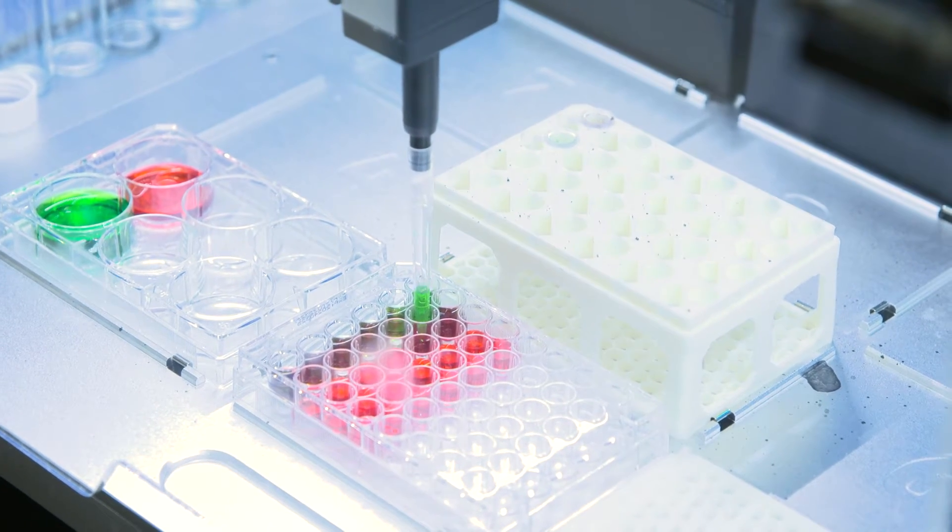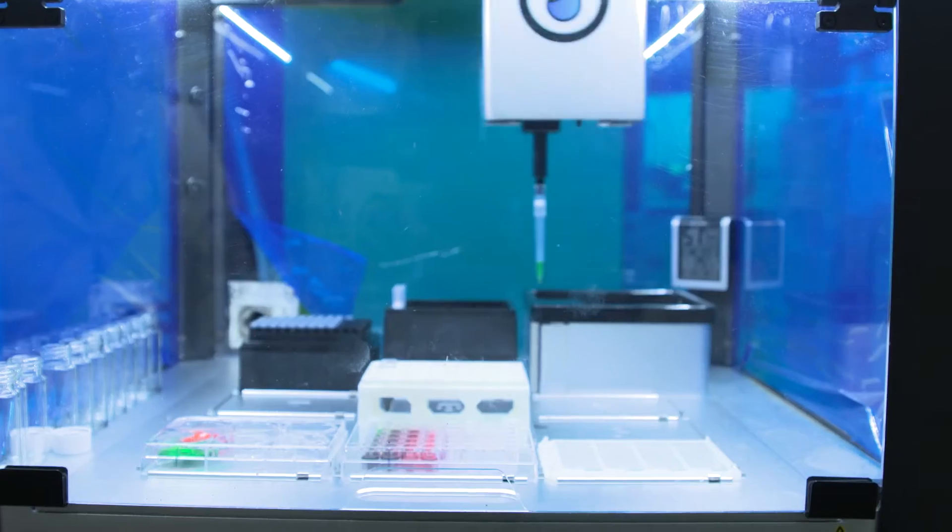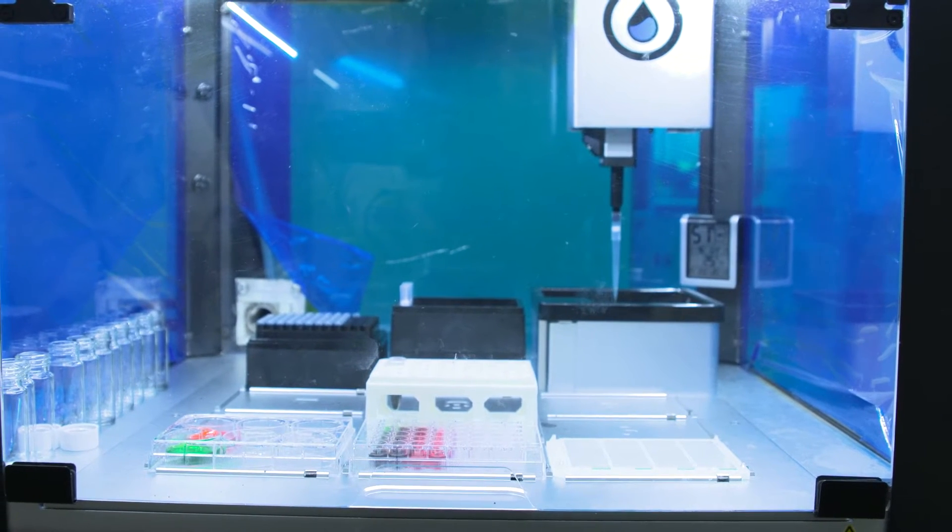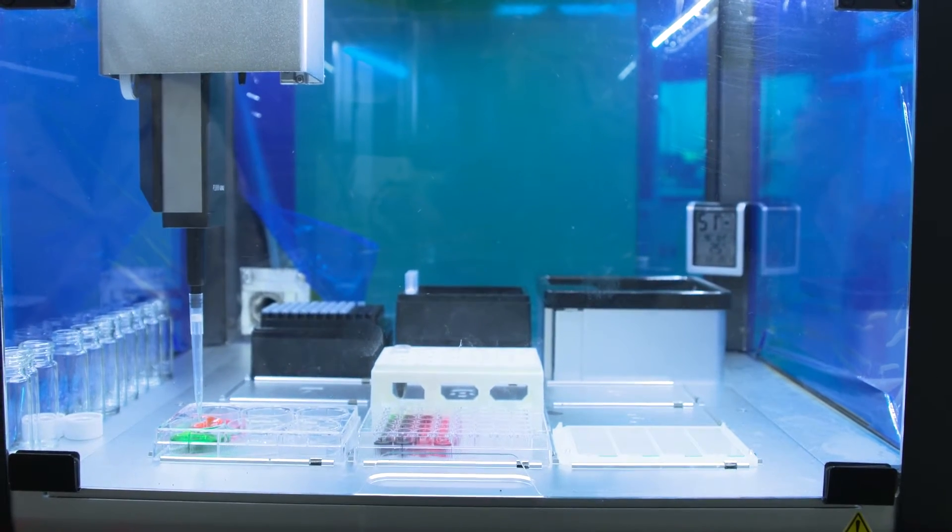We can change our hardware very quickly. The moment the experiment changes we build something new, we integrate it and that's how we are streamlining the experimental design workflow process.